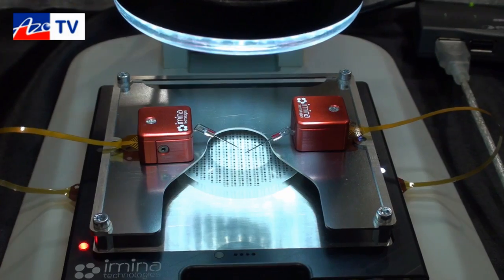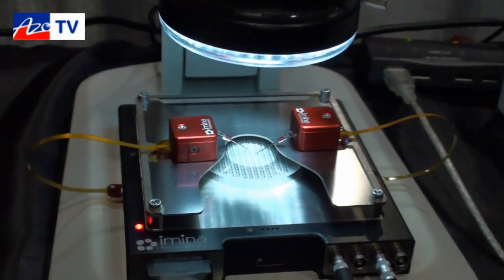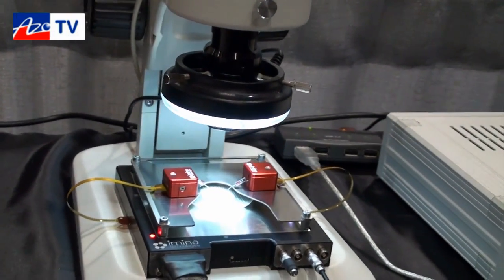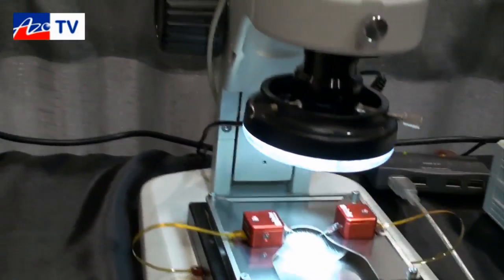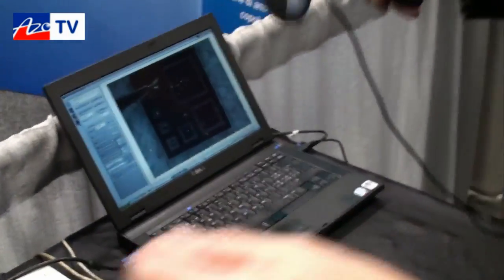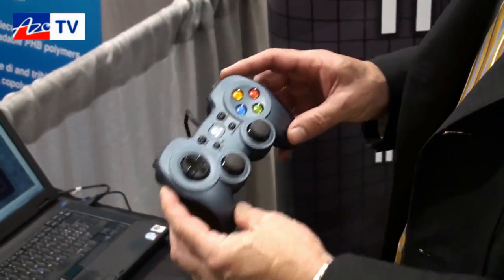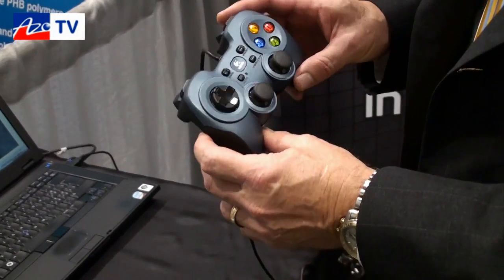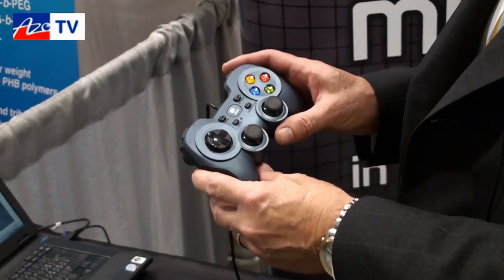They are working in teams of up to four. You'll notice that they are not physically anchored to that substrate, but they can move around it independently. And perhaps, Tom, you could show us the controller? This is something that almost everybody under the age of 40 would be intimately familiar with. It looks an awful lot like what you might have in your living room.